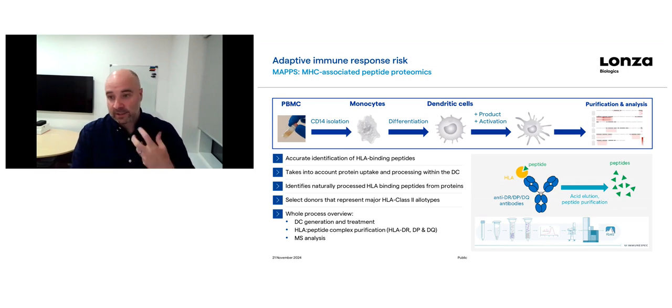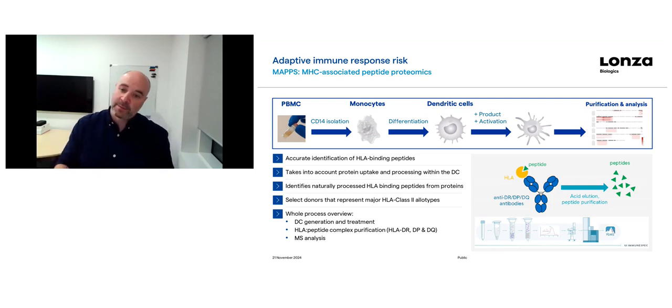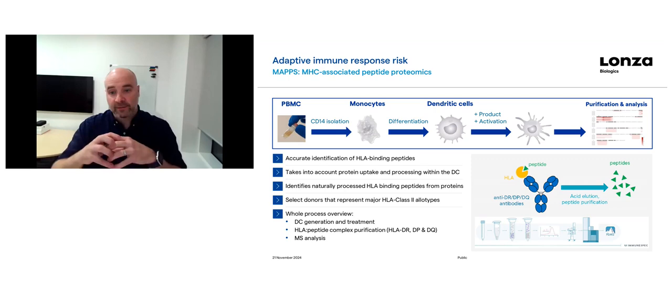And it's these dendritic cells that we treat with the protein of interest. And then we allow them to take up, start to process, and then we activate those dendritic cells with LPS, for example. And then the cells switch from being very efficient at taking up protein to being very efficient at processing and presenting peptides from that protein via HLA receptors on the cell surface. So at this point, we've got very activated dendritic cells. They've upregulated the HLA-DR and other class 2 alleles on their surface, and they're loaded with peptides from internal, from the media, and from the protein of interest as well.